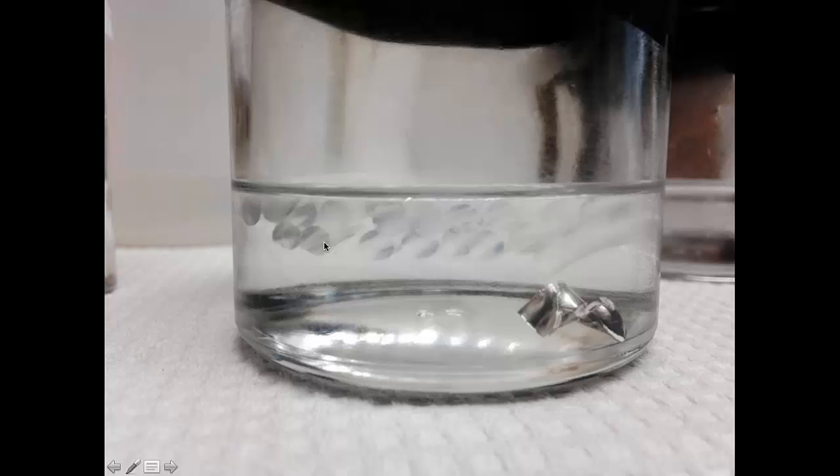So just take them with a tweezer, put one inside the NMR tube, the tube of the device. Then you add your solution, let's say 50, 70 microliters of the solution of the compound. Then with the plunger of the device, you pump it, for 5 minutes, 10 minutes, like you listen to a nice music song or whatever, and then it will equilibrate. And then you can proceed to do the shimming, the way I showed you. And once you do the shimming, and you compress it to the degree of compression you want, you are ready to go.